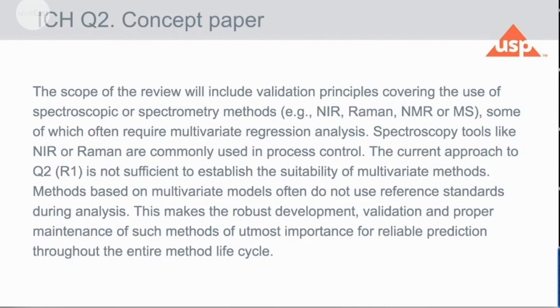And also to incorporate the basic elements that allow people to use what ICH called the enhanced approach, which is method development using analytical QbD, ATP, all the elements we described in 1220. Within the discussion, initially the intention was to create only one guidance. As we moved into the discussion, the decision of the working group was to create two different guidances, ICH Q2, which is basically the validation document.